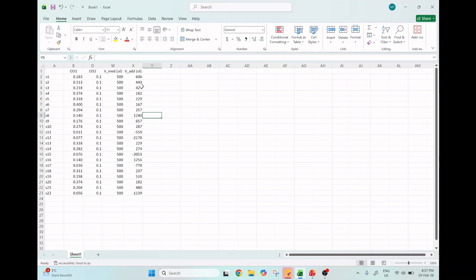Okay, so now this is the amount of volume that you have to add to each of those tubes. And once again, why this is helpful, why this is saving time, is because you can use the same amount of solvent or the same amount of culture medium, and you don't need to adjust it for each tube individually. You don't need to reset your pipette every time. And of course here, you also can do that even before you start your OD measurement. You can already prepare that. You have less time where your cells will be just growing compared to the other case where you still have to do that after you have done your OD measurement.